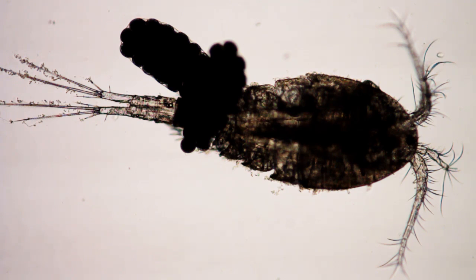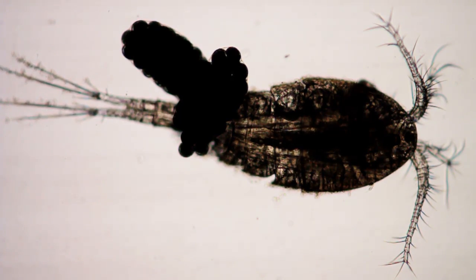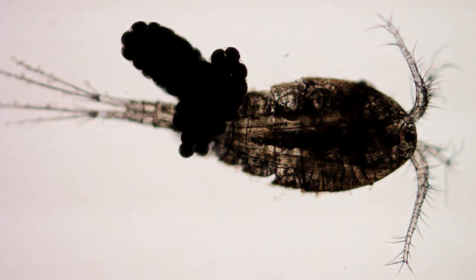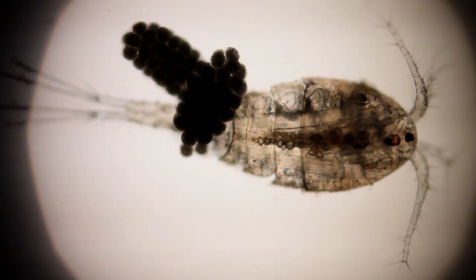I'm using a 4x Nikon Plan Achromat lens. This is with the flip-up lens in place on the condenser. We're still at 4 power. I kind of like this view — it shows a lot more of the structure.